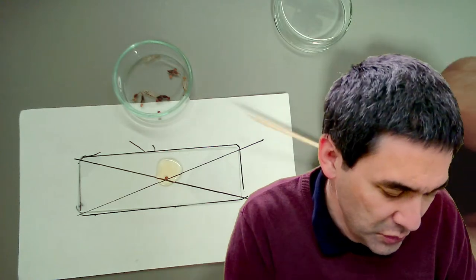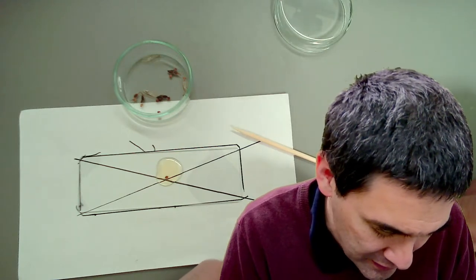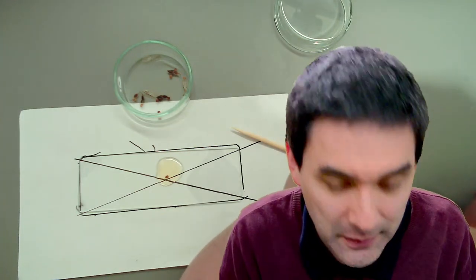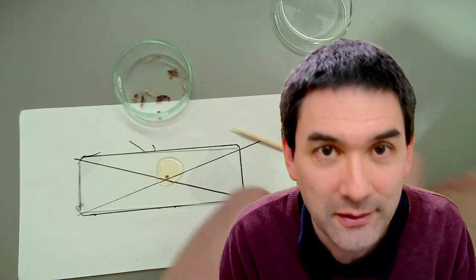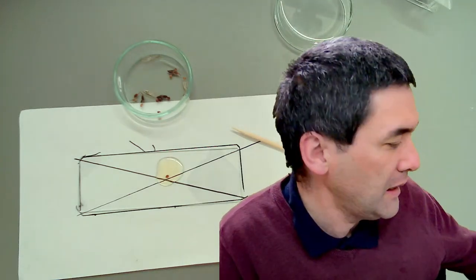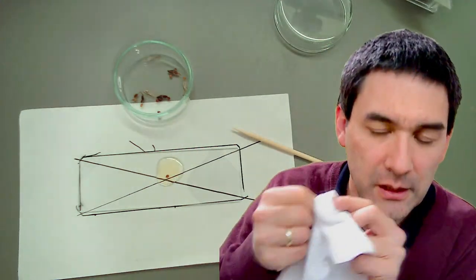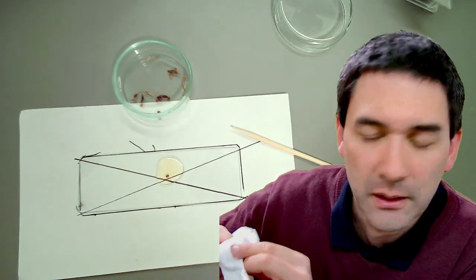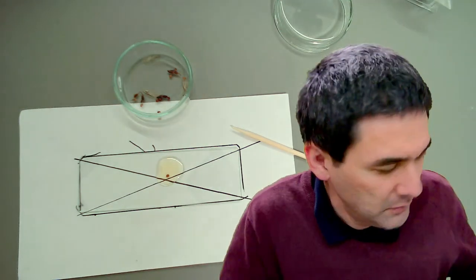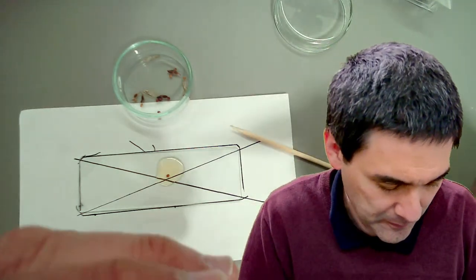And what I want to use now is the round cover glasses. I bought myself some round cover glasses. Again, they're also a little bit more expensive. I always keep on looking down now. Always keep eye contact with the audience. So these are round cover glasses that I have, and these I do have to wipe a little bit, okay? Because they too look a little bit not so clean. And how do we do that? Either I can use my fingers, or I use my tweezers.